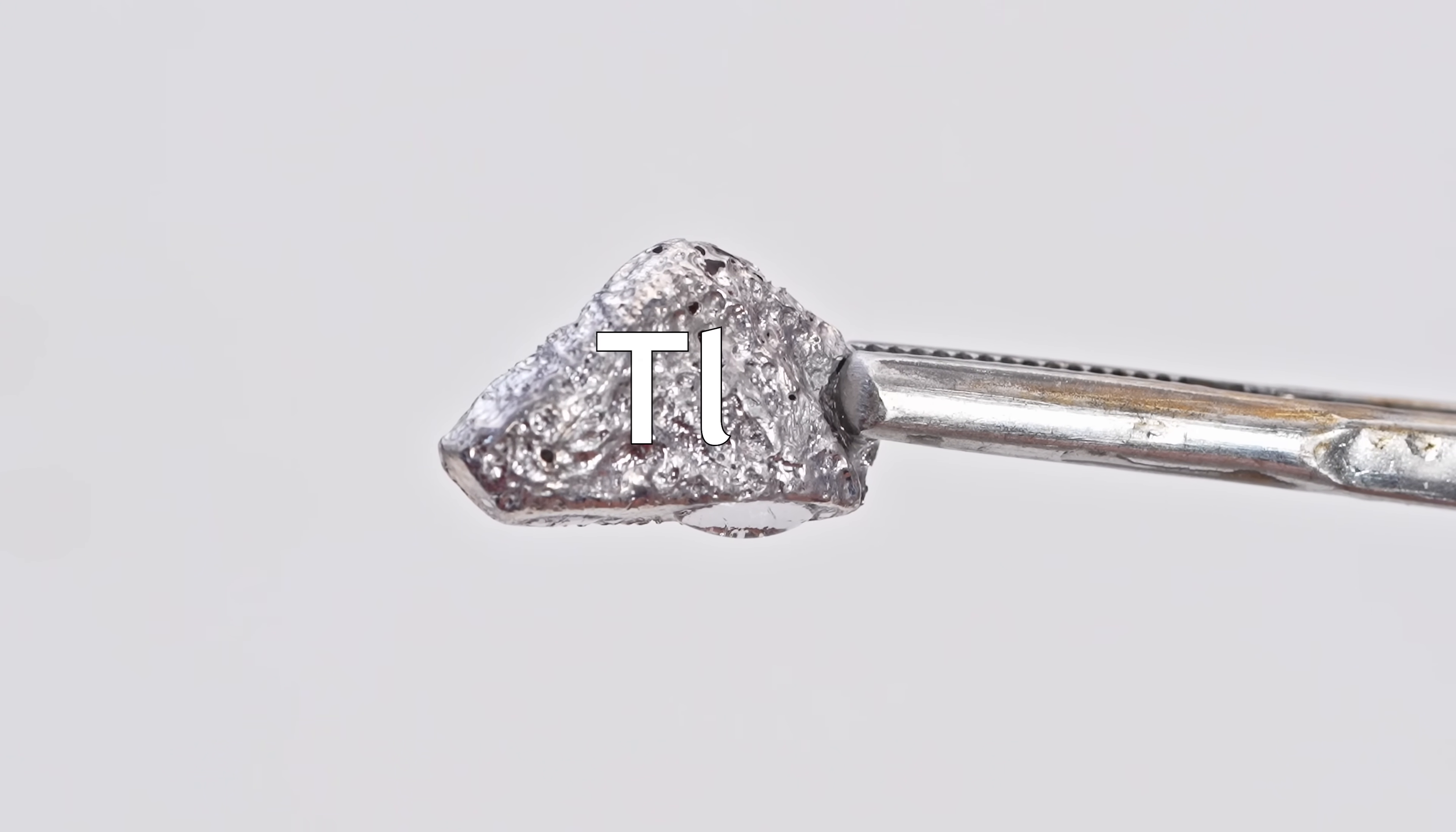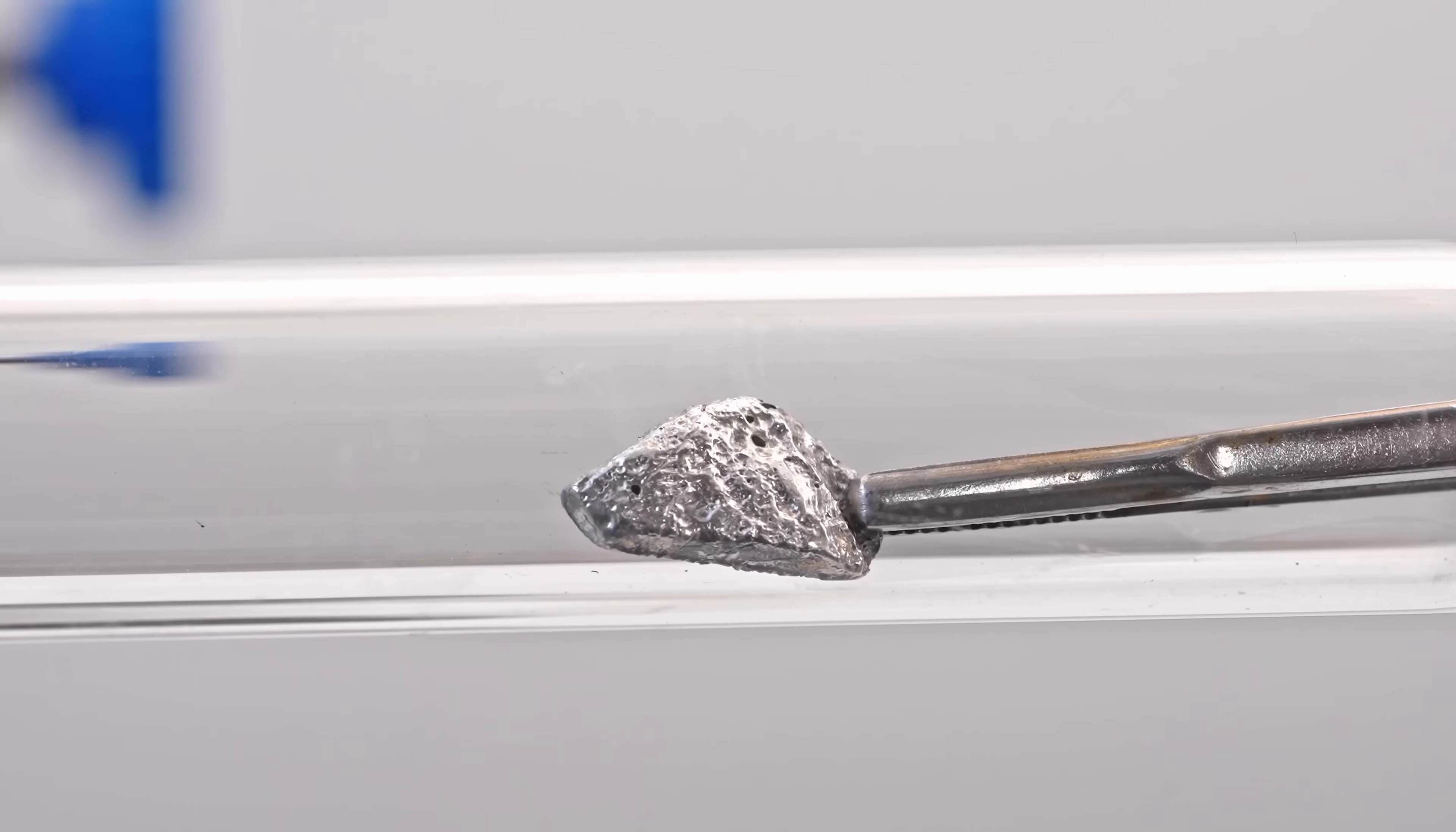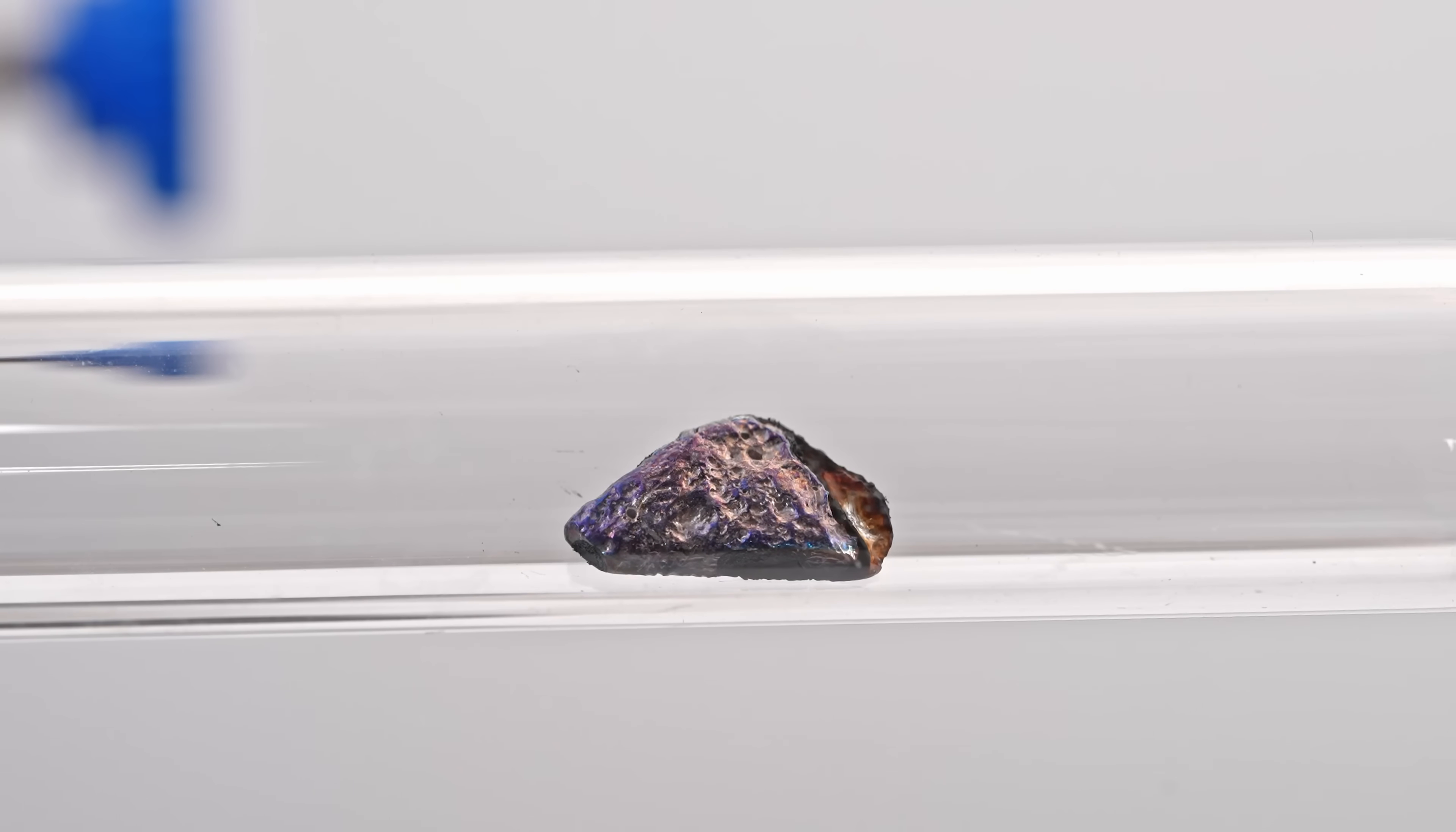Here is a shiny piece of thallium, which reacts uniquely with ozone. I'll place it in a glass tube and pass ozonated oxygen through it. Upon contact, thallium changes color, first to light brown, then to blue. This is due to both the formation of thallium oxides and light refraction through the oxide film.